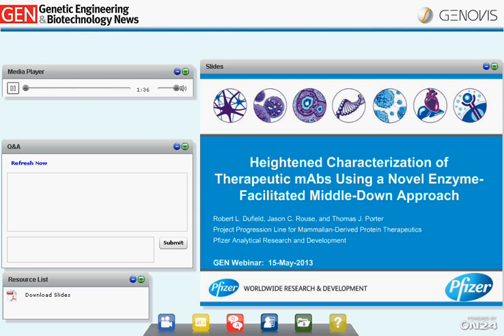Good afternoon. Today, I'd like to speak to you on heightened characterization of therapeutic mAbs. Today we'll be illustrating how we use a novel enzyme-facilitated approach, which enables us to address a middle-down characterization strategy for mammalian-derived protein therapeutics.